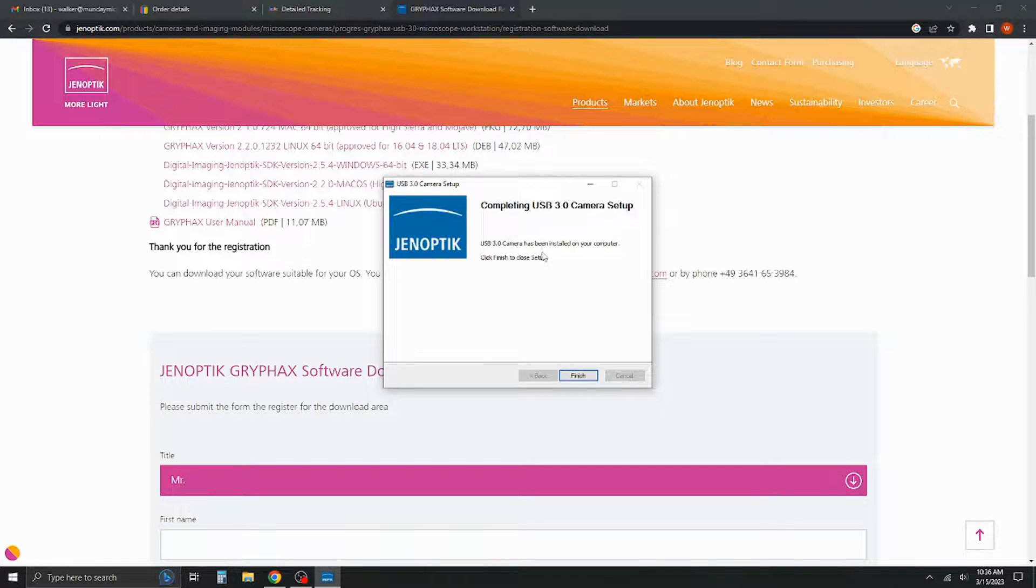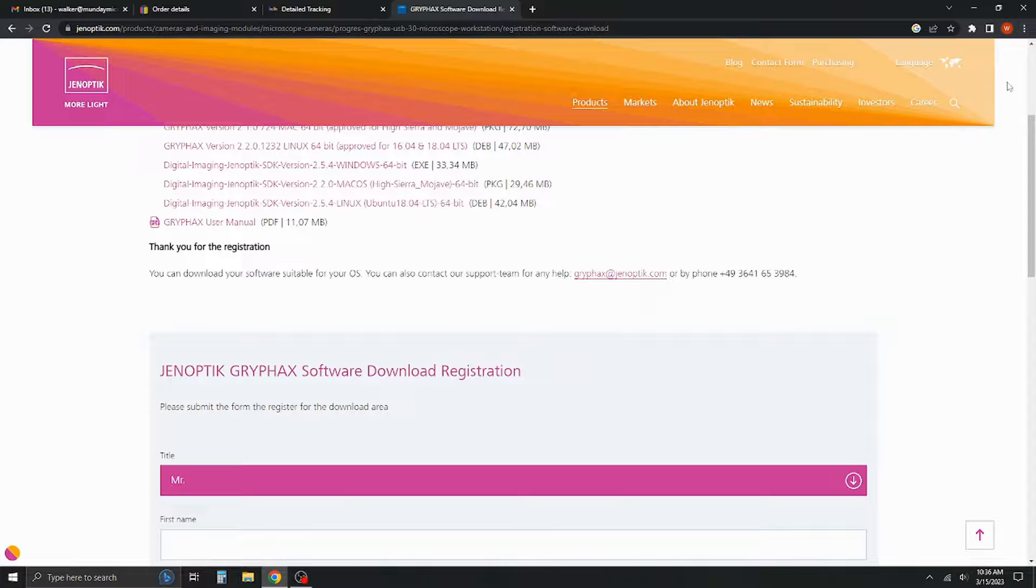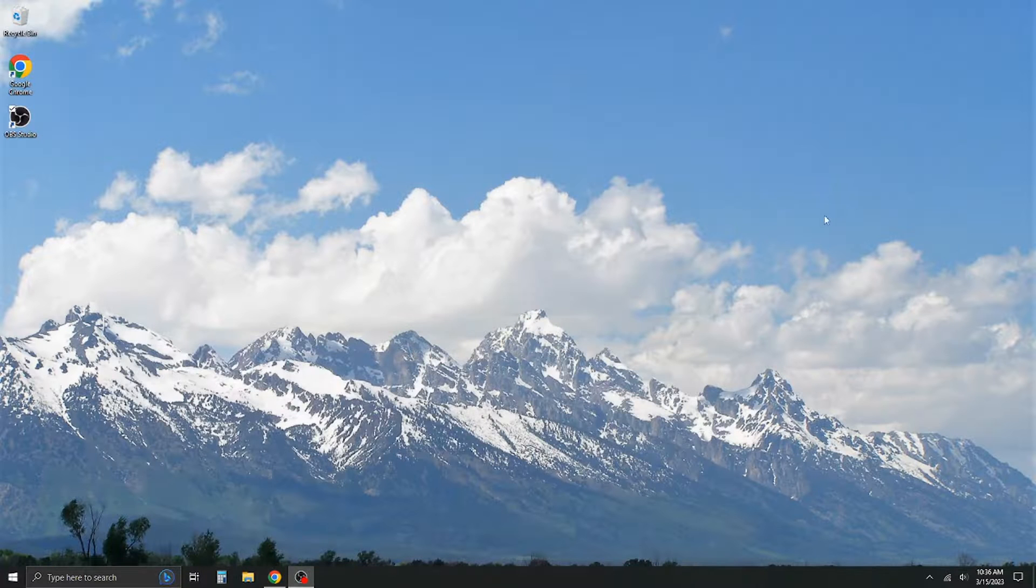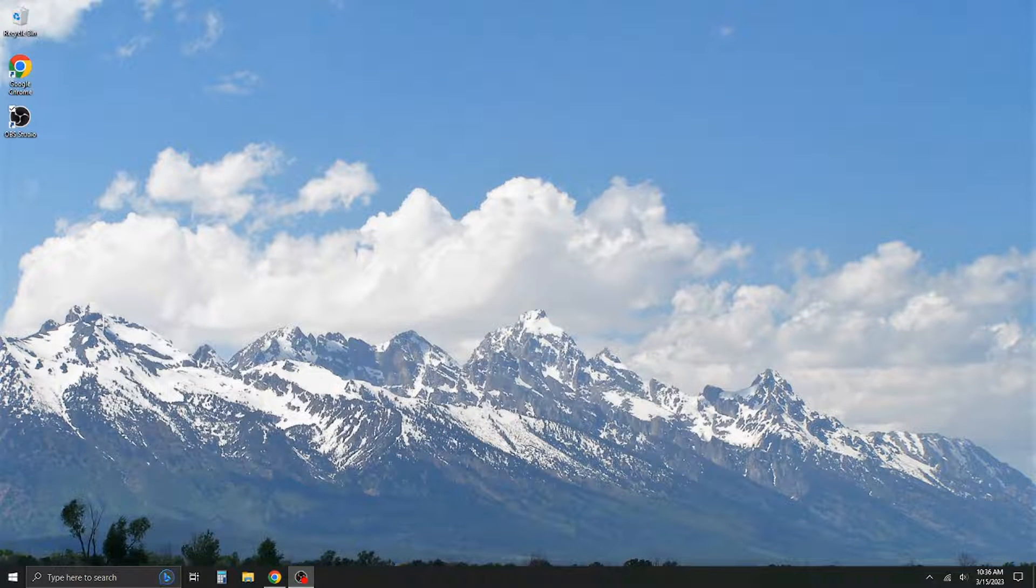Okay, looks like it's been installed on my computer. I'll go ahead and click finish. And I'm going to minimize the browser window here.